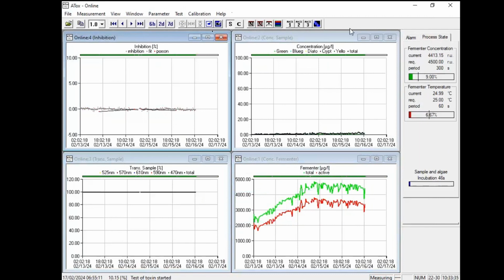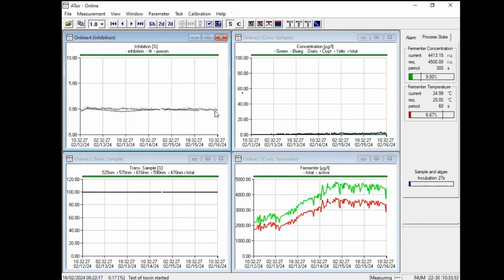Okay, that is the toolbar more or less. You navigate in the data, left, right, one time series, or go to the last data that are the newest data at the right side.